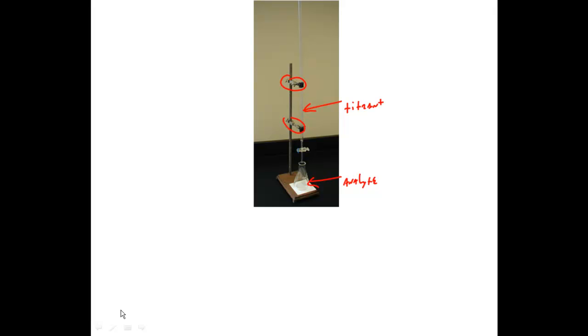So make sure that you fill up that burette all the way up to 0, somewhere around 0. Make sure that you get that air bubble out of the tip. Make sure you have solution all the way through it. You have your analyte in that Erlenmeyer flask. You also add your indicator. The indicator also goes in that Erlenmeyer flask. And then you're ready to go.